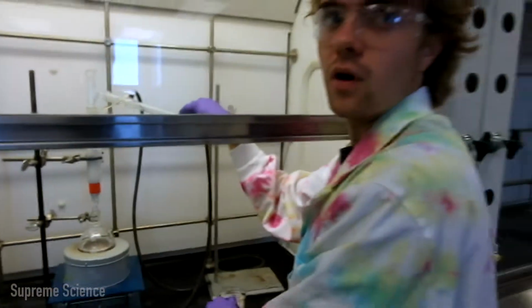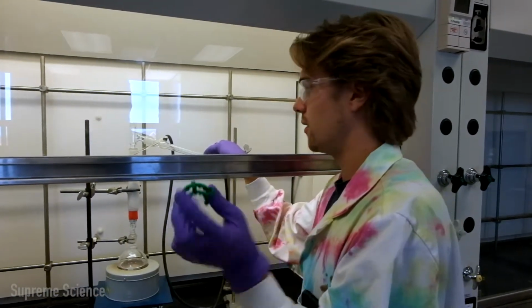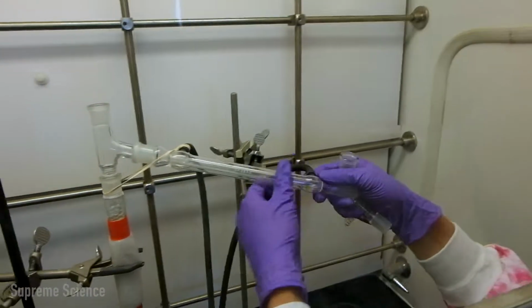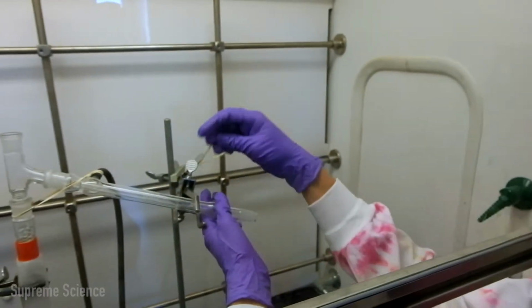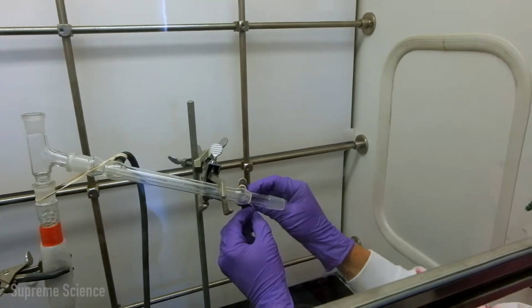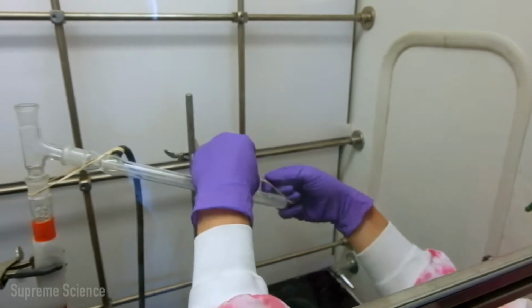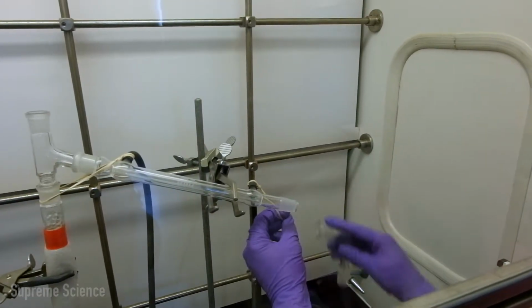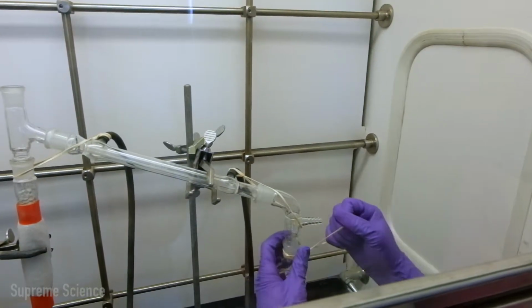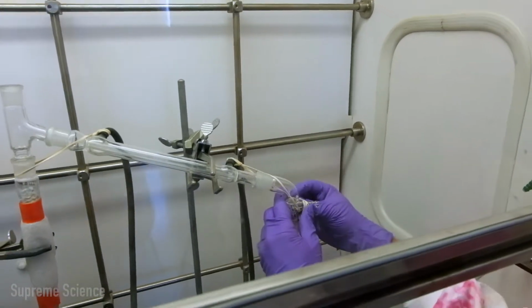An alternative to the elastic bands is these keck clamps. If you have access to those, that's another great resource. We're going to have another retort stand in here just for support of our column. In a similar way, we're going to attach our receiving flask. So we have our elastic hoop on our water tubing. You can wrap that a couple of times around to tighten it.